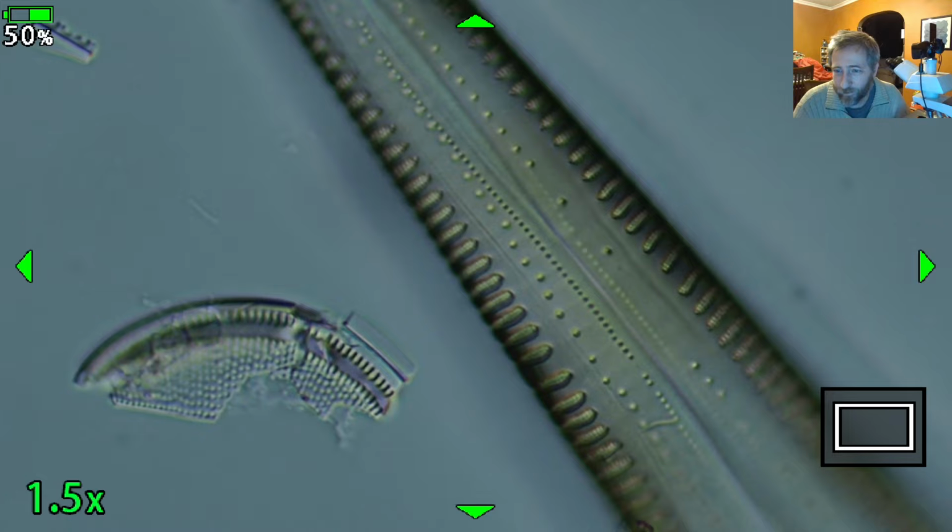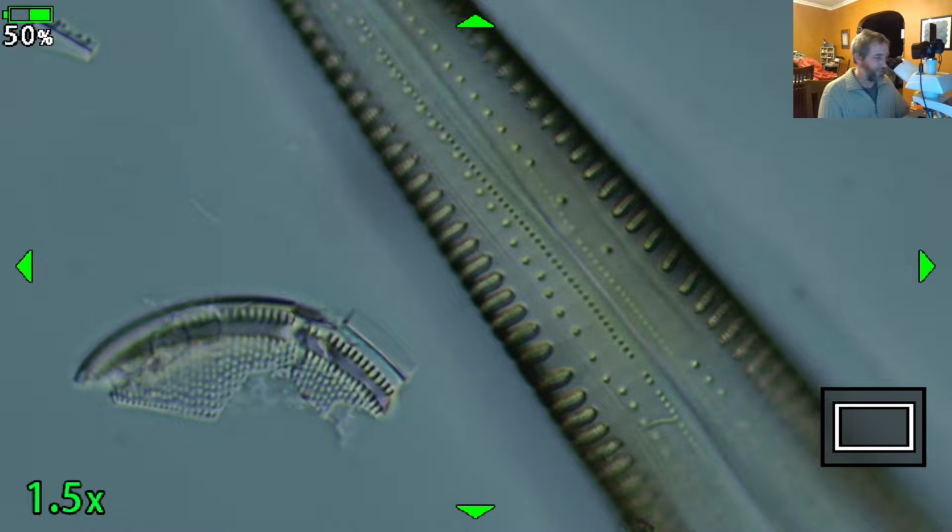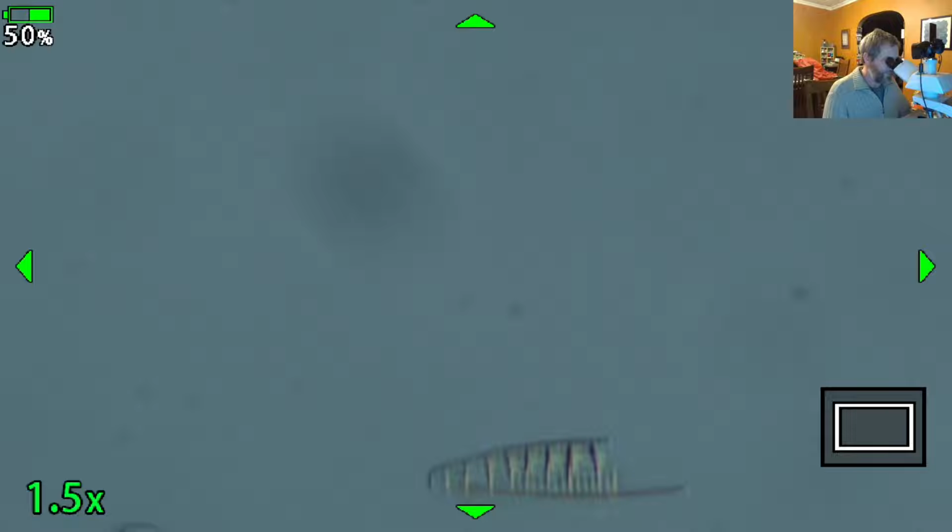Are diatoms animals? No, they're algae. But they're kind of a weird algae because they can crawl around. And so you might confuse them for something else. People usually think of algae as things that just kind of sit there, that don't move or do anything except for grow. But in fact, diatoms can crawl around.